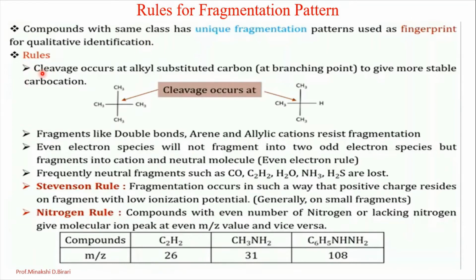Then, as we have studied, fragmentation is nothing but the cleavage of bonds. So in the fragmentation process, there is a cleavage of carbon-carbon single bond, carbon-hydrogen, carbon-nitrogen bond. Hence, it is necessary to understand the rules of fragmentation for different organic compounds.